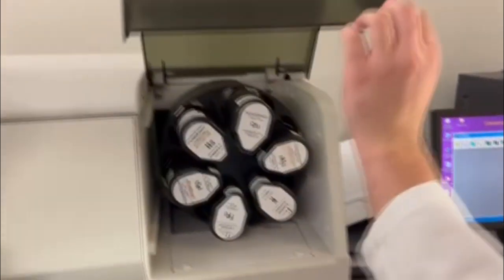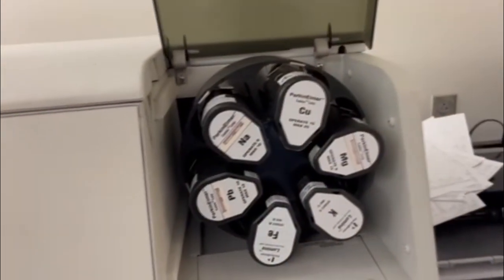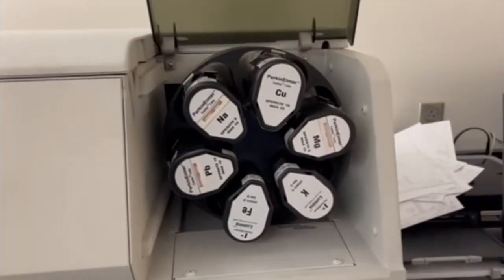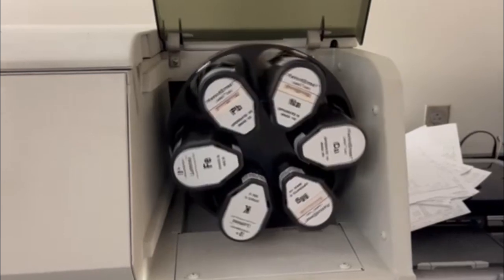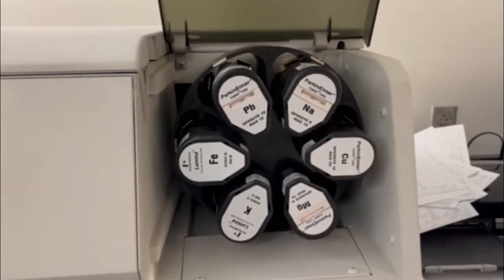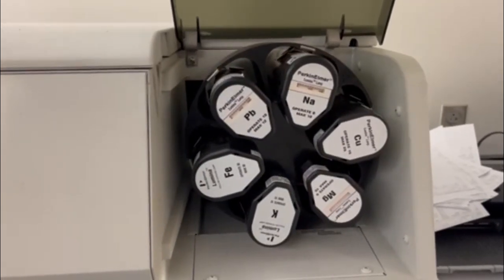Now, in these experiments, you will always be looking for a specific metal. So you need to make sure that you have a corresponding lamp already loaded in the AA instrument. In this case, since we're searching for lead, we don't need to change out any of the lamps and we can safely close it up.